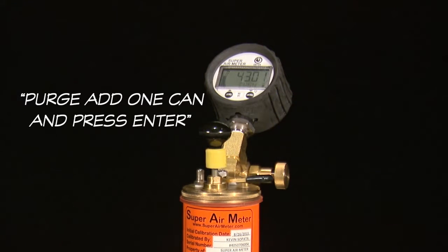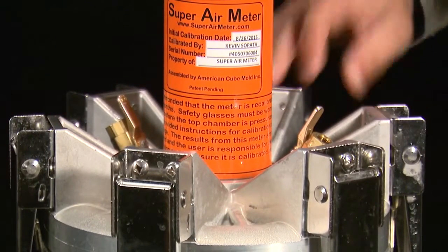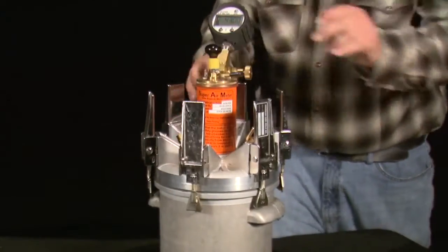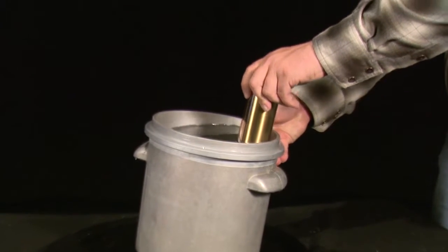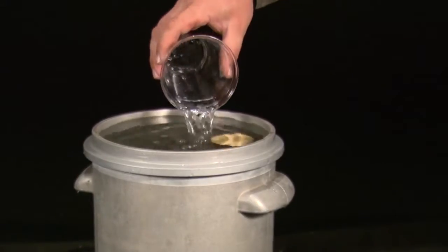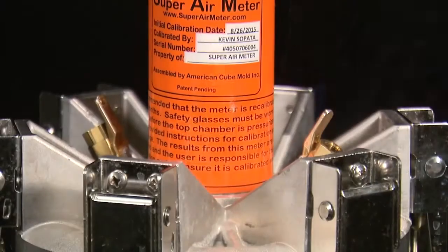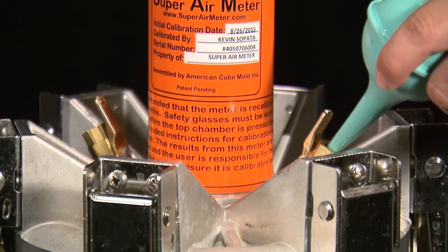The gauge will then display the next set of test directions: purge, add one can, and press enter. Open the petcocks to relieve the pressure of the bottom chamber, keeping your hand over it to avoid spraying anyone. Then open all the clamp arms and remove the SAM lid from the unit weight bucket. Insert the Pro Cali can into the unit weight bucket against the side where you will be tilting the meter to purge the air. Attach the lid, tightening opposing clamps until all six clamps are tensioned. Purge the bottom chamber of air using the petcock valves and the filling bowl, tilting the meter to get the last few bubbles out.